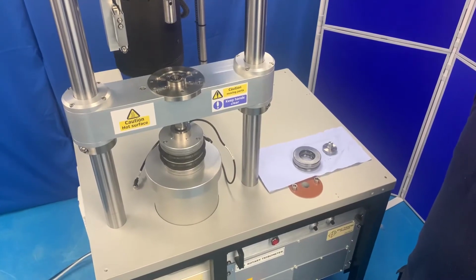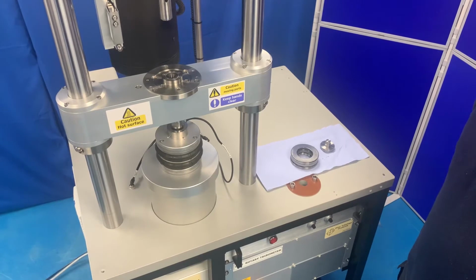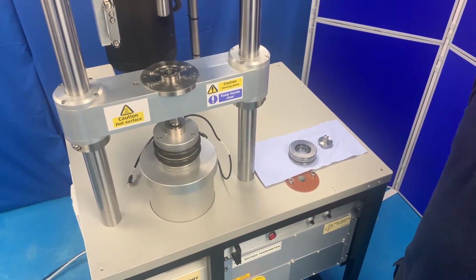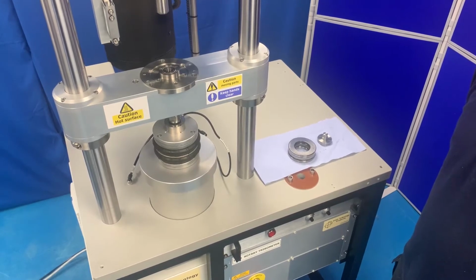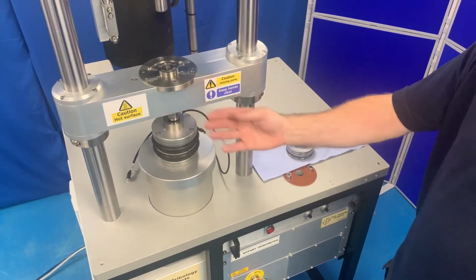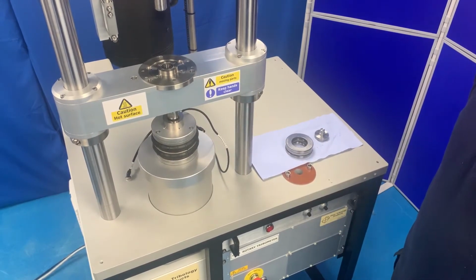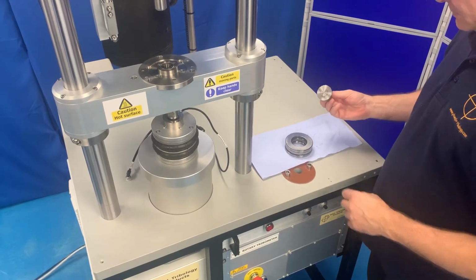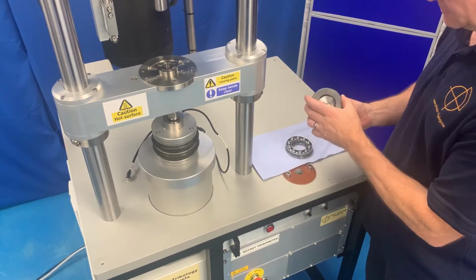The machine is supplied without the thrust bearing fitted, and this must be fitted before operating the machine. The bearing should be fitted to the bearing support on the crossbeam of the machine. It is important that the bearing is fitted the correct way round. The spigot should be a tight fit through the race, which is fitted to the top of the bearing, as demonstrated here.